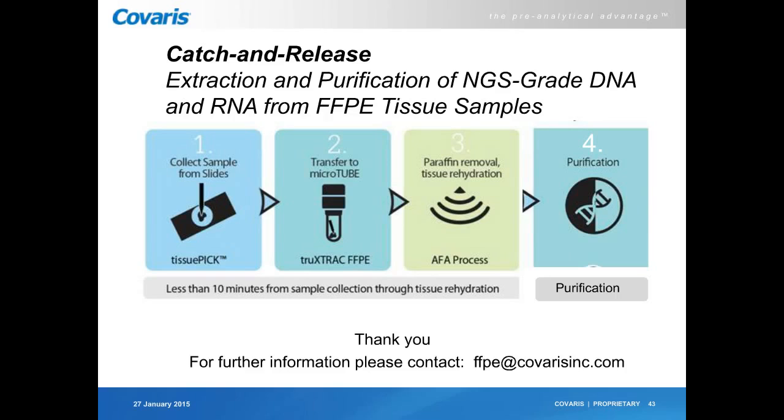So why is it so different? That's really the way that it's done in aqueous solvent. Compared to all other techniques that are pretty harsh, either heat or different types of organic solvent, the fact that we are able to do that in aqueous buffer at room temperature means that we really preserve both the DNA and the proteins during this active paraffin removal step.